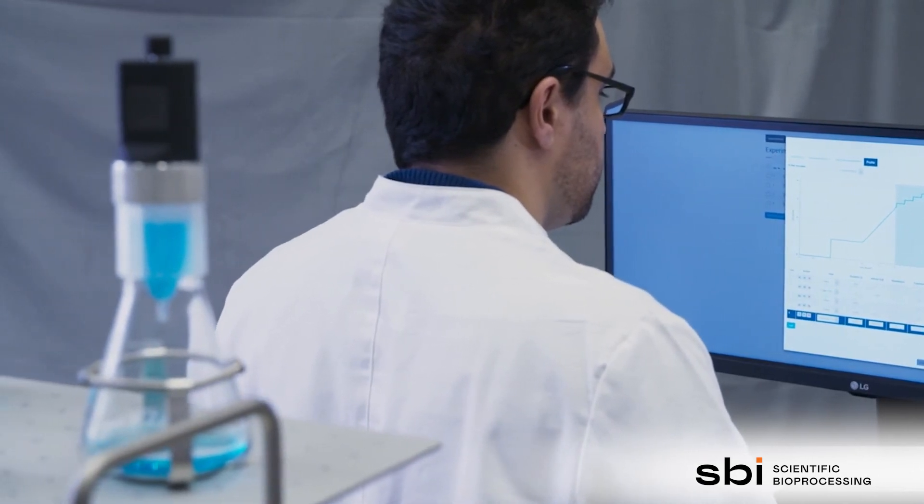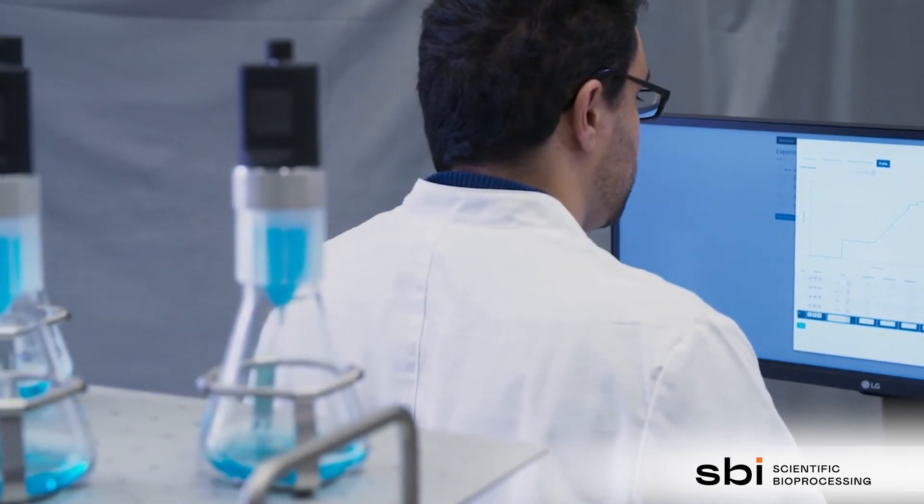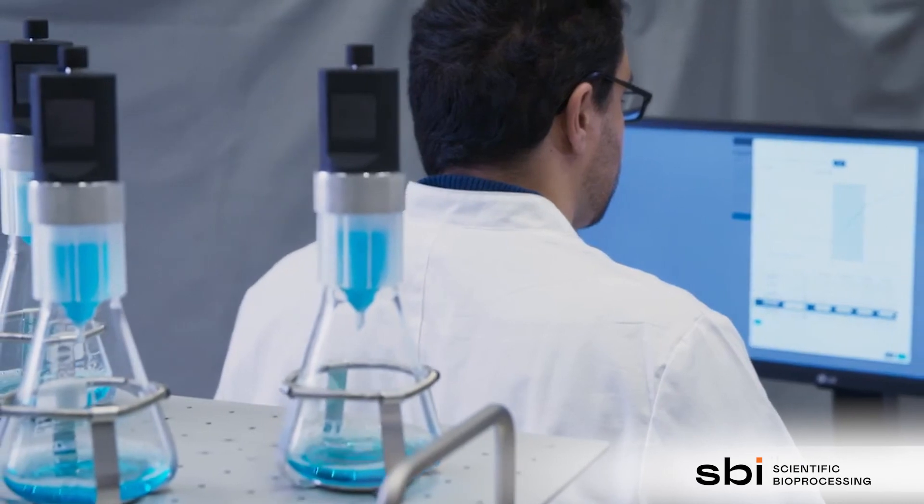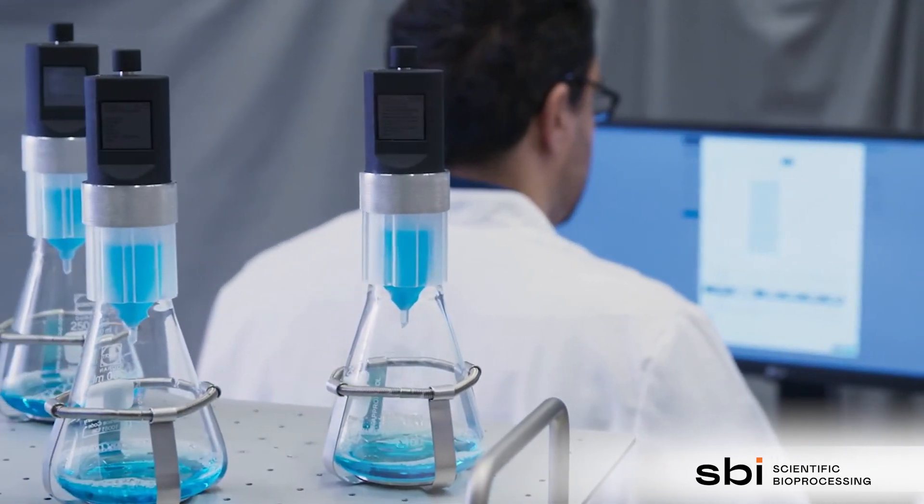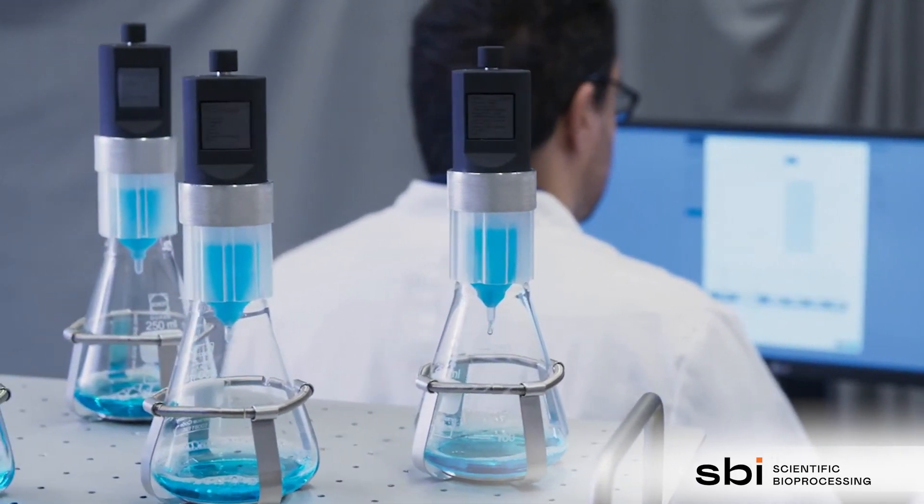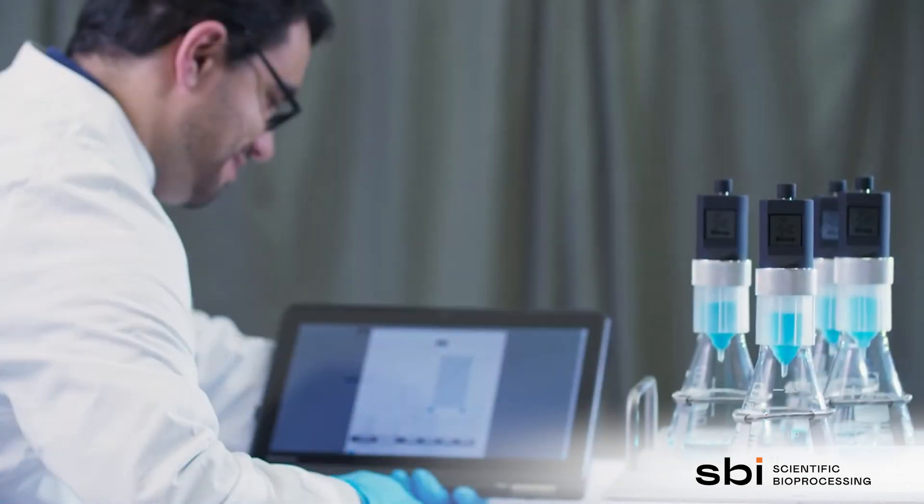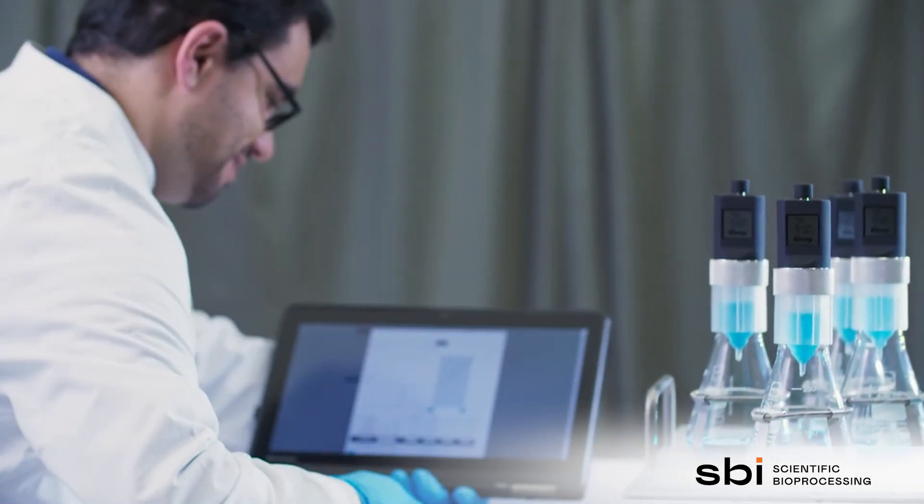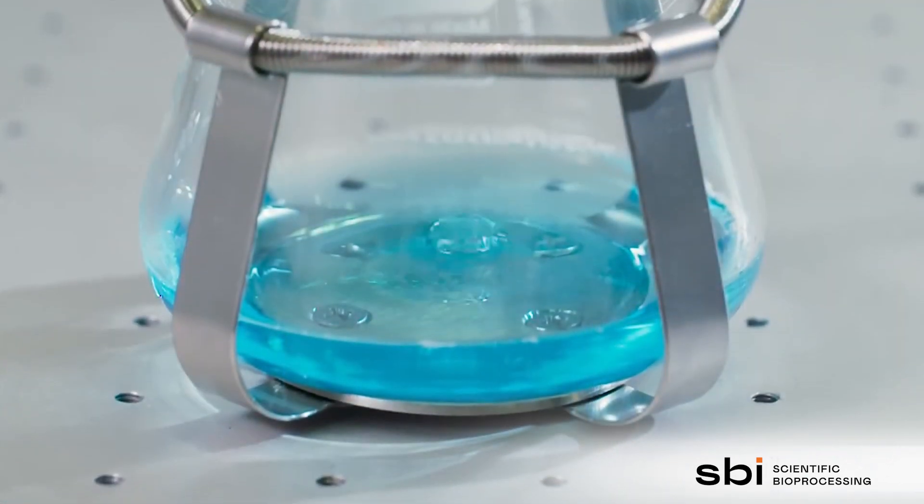LIS will now automatically feed the liquid into your shake flask based on your feeding profile. This allows you to unlock completely new experimental possibilities in shake flasks such as fed batch or automated induction experiments.